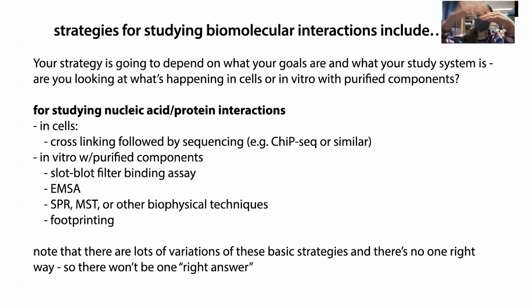You get your proteins to bind to it, then you chew it up with DNase I, basically cutting the DNA. Then you separate all the different pieces and look to see what region is protected, meaning you don't have any pieces corresponding to DNA of that length, and that tells you it's protected. There are also toe-printing techniques where you sequence up until the protected region. So there are various techniques you can use to get information on the actual location of binding.